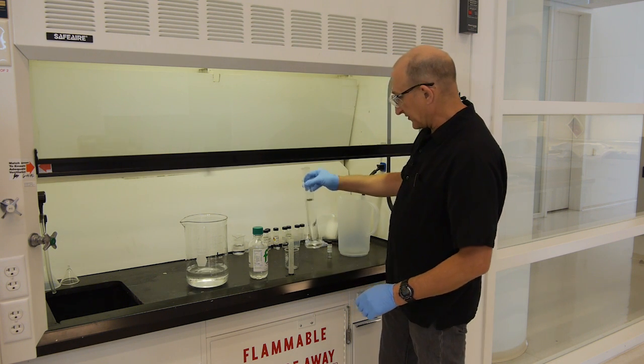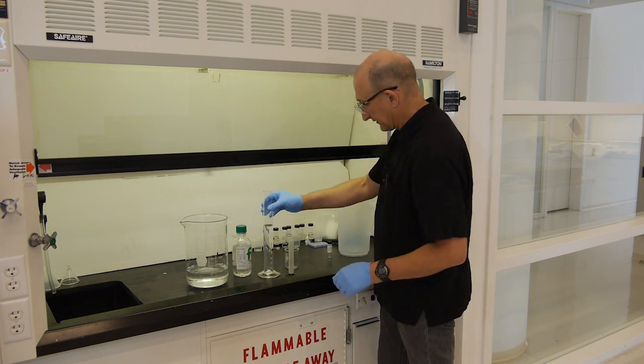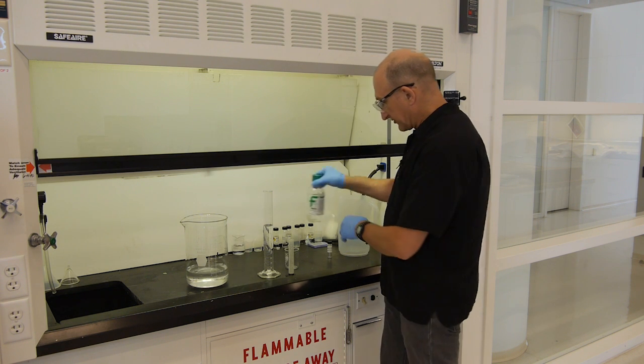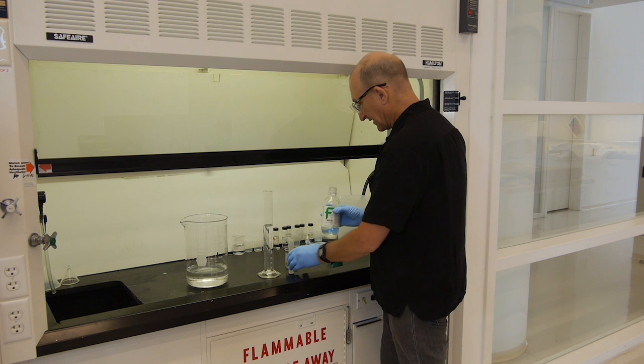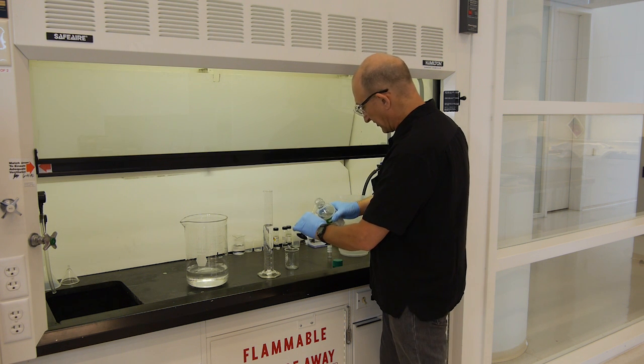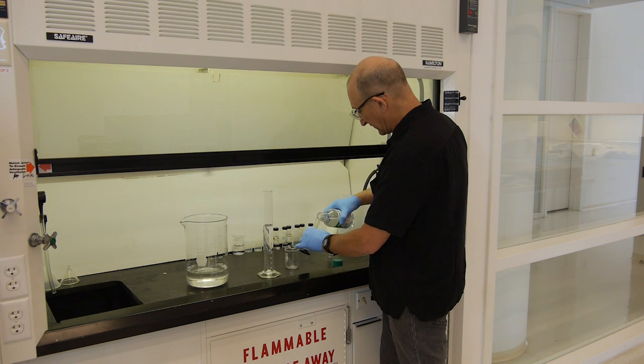So here we have 180 milliliters of deionized distilled water in our graduate. And we'll take 20 milliliters of the ammonium hydroxide. This is the concentrated ammonium hydroxide, so it's 27% ammonia gas dissolved in water.